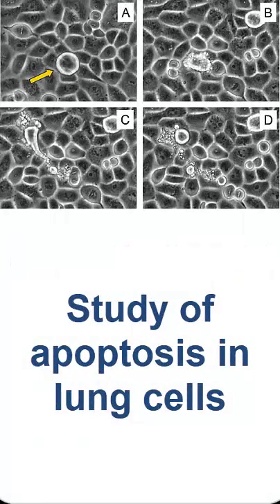Disadvantages. The largest disadvantage is the cost. There are fewer manufacturers and the engineering to manufacture the microscope is more expensive. This means there are fewer used microscopes of this type on the market and less competitive pricing.